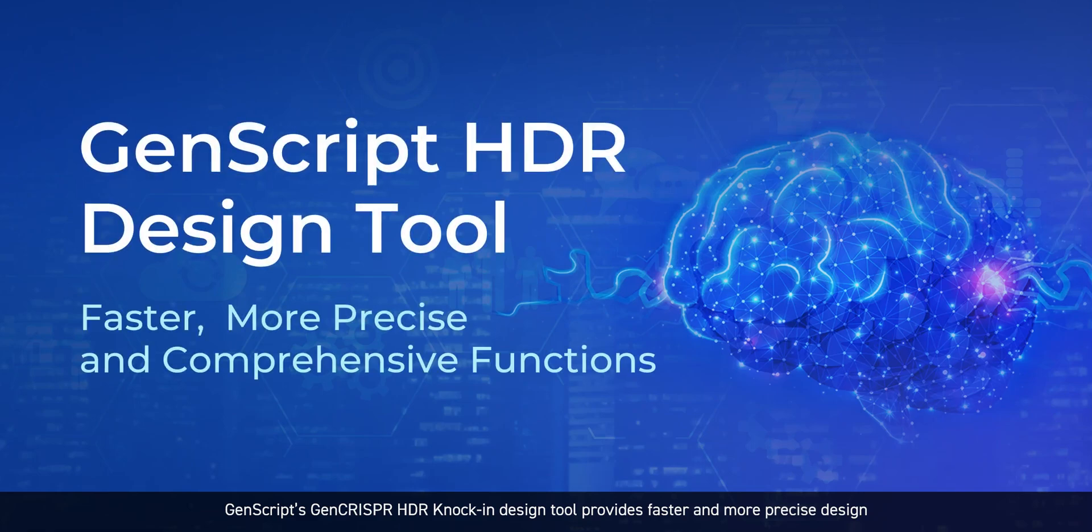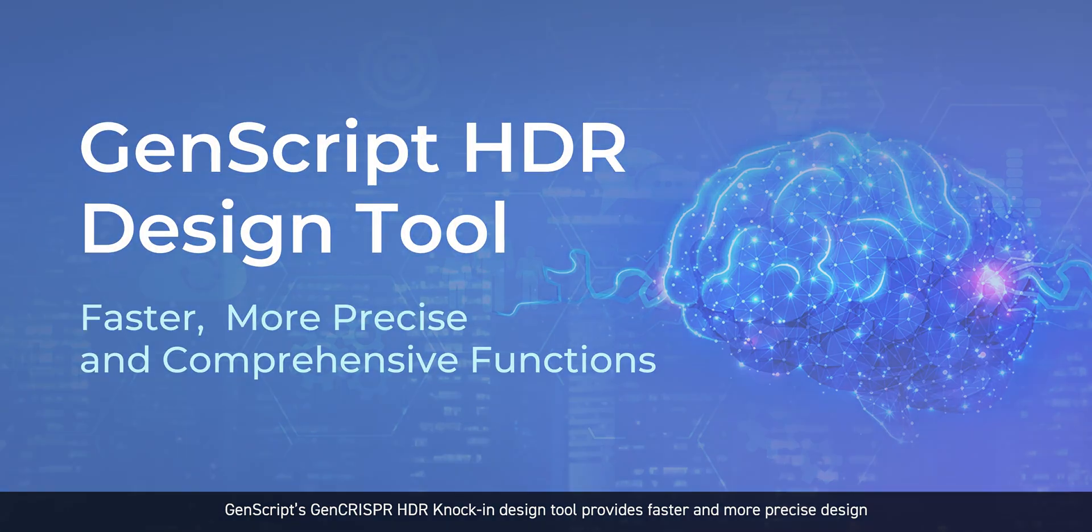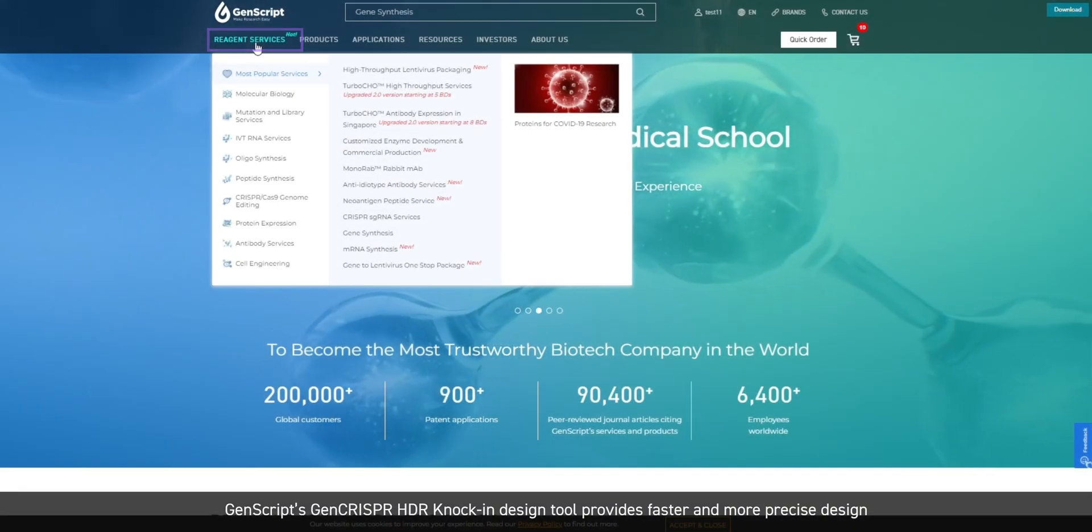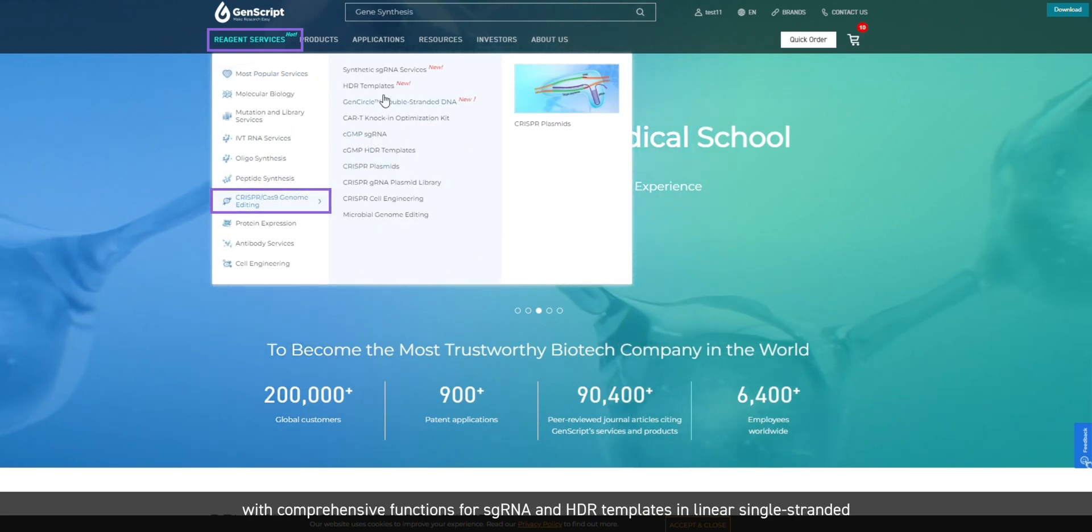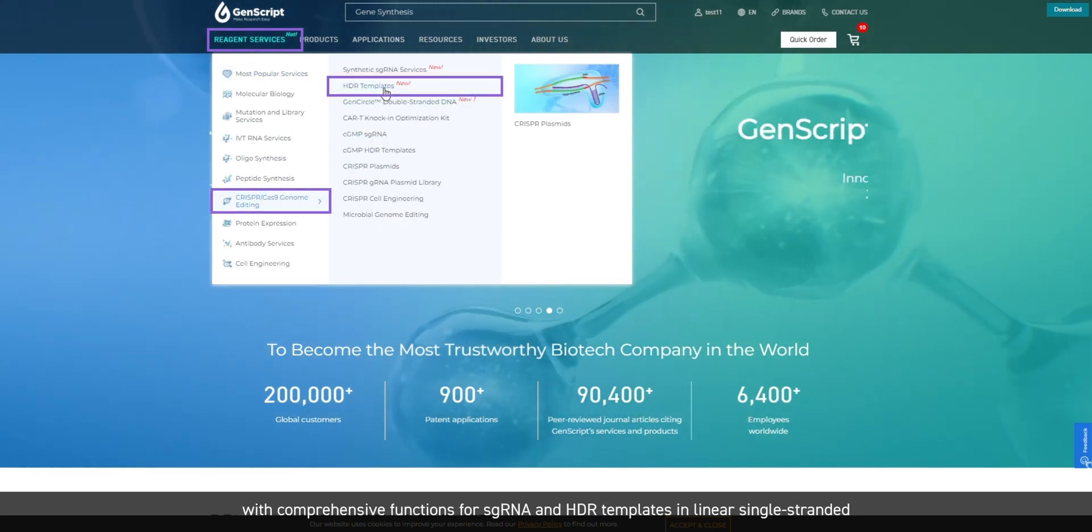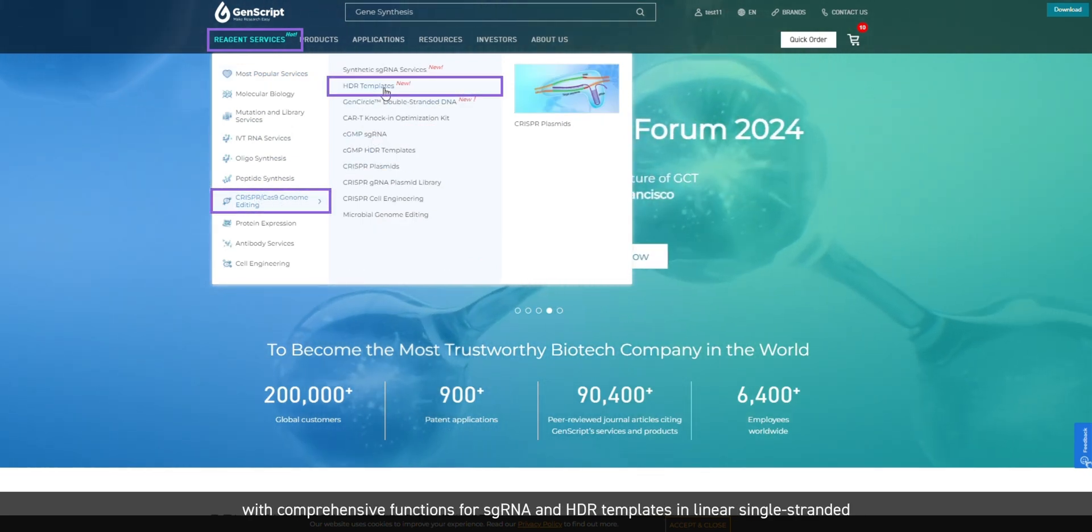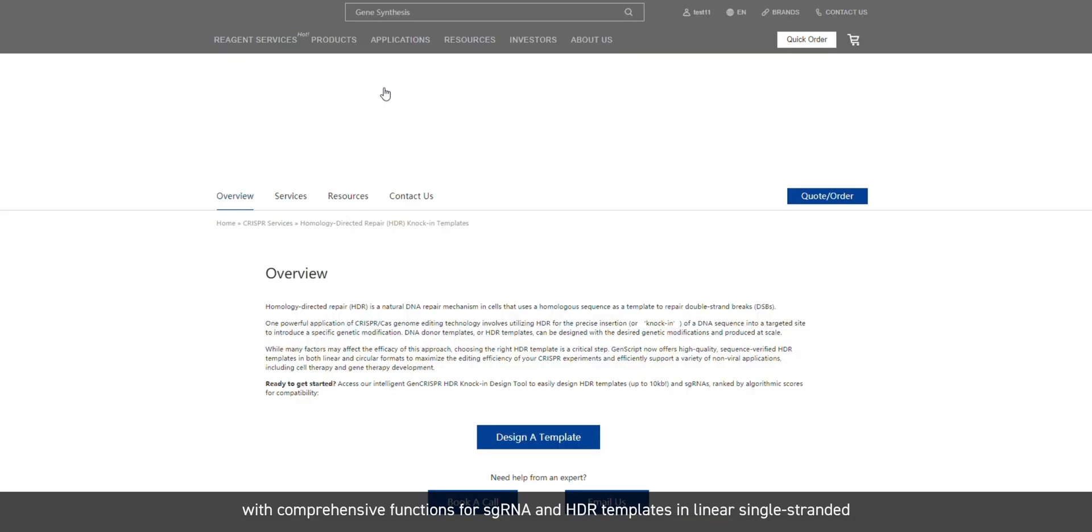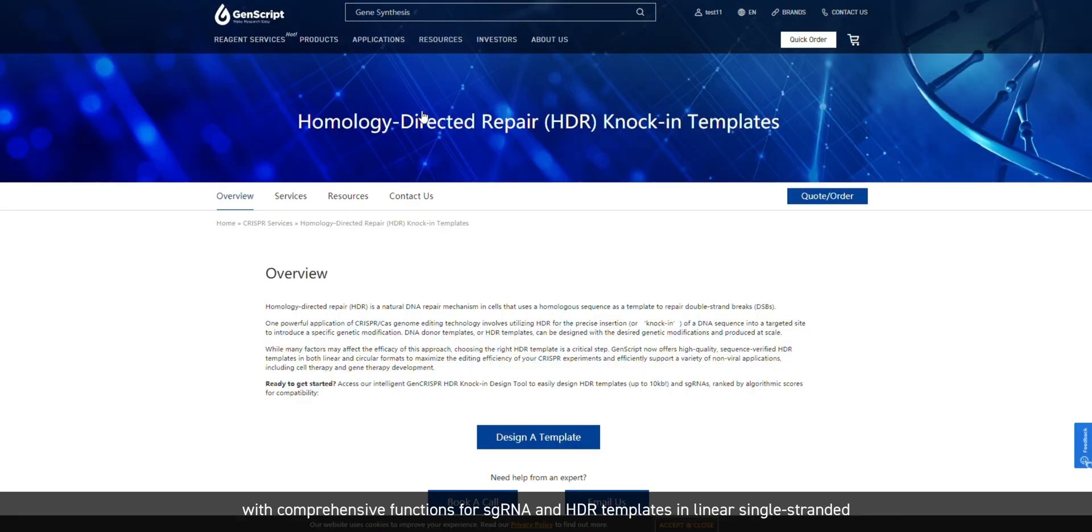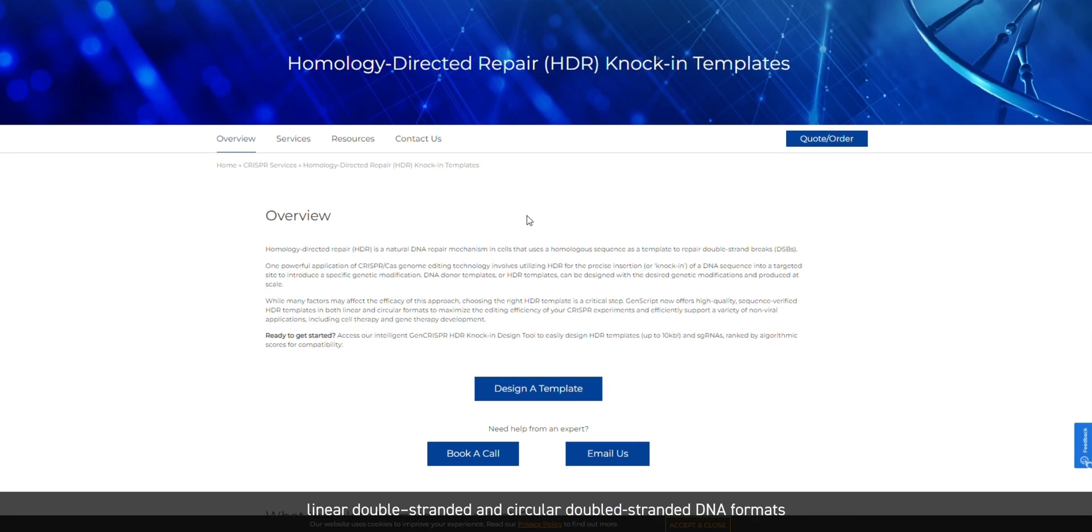GenScript's GenCRISPR HDR knock-in design tool provides faster and more precise design with comprehensive functions for sgRNA and HDR knock-in templates in linear single-stranded, linear double-stranded, and circular double-stranded DNA formats.